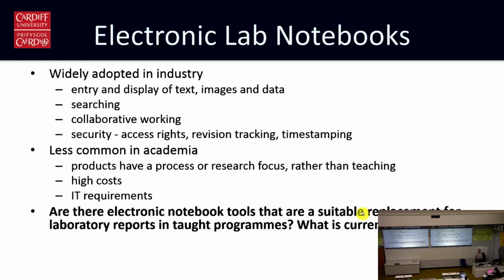There are a number of advantages to using a digital system. For example, searching, collaborative working in groups, and also particularly from the perspective of the highly regulated pharma industry, security, access rights, time stamping and digitally signing documents.